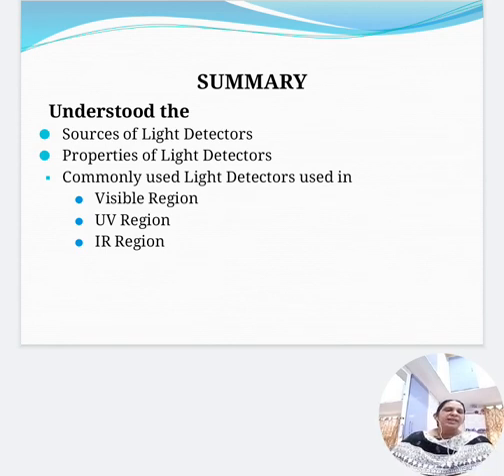Photovoltaic cells are self-generative cells. They are very simple in construction, rugged and simple. They require no auxiliary power. They consist of a metal plate such as iron, which is used as one electrode, and a thin layer of semiconductor material such as selenium is deposited on this base electrode. Then a very thin semi-transparent layer of silver or gold is sputtered over the selenium to act as a second electrode collector. When radiant energy falls upon this selenium semiconductor, it produces electron hole pairs at the silver selenium interface. The electrons pass to the silver collector electrode. In this way, the flow of current in the external circuitry is nearly proportional to the radiant power of the incident radiation. This is the case of photovoltaic cells.